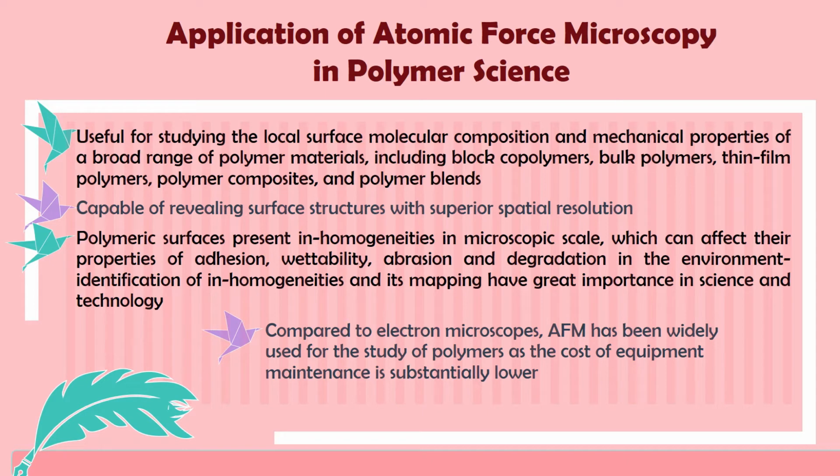Application of atomic force microscopy in polymer science. AFM is very useful for studying the local surface molecular composition and mechanical properties of a broad range of polymer materials, including block copolymers, bulk polymers, thin film polymers, polymer composites, and polymer blends. It is capable of revealing surface structures with superior spatial resolution.